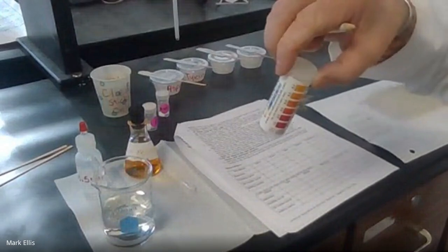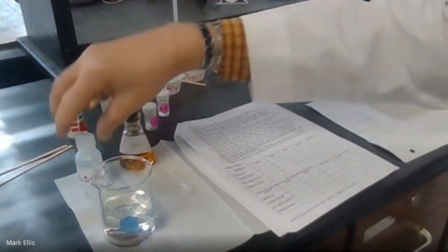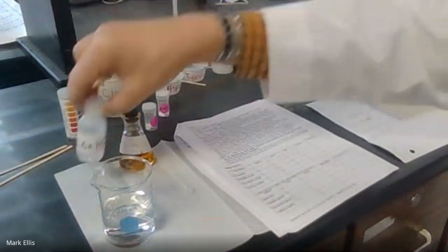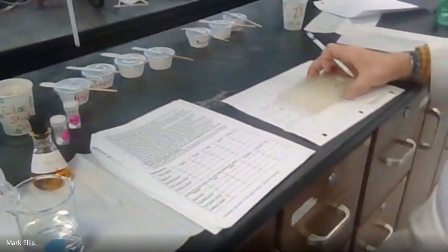Same with this. If you take the cap off, put the cap back on. Same with this. If you take the cap off, put the cap back on. Nice and neat all the way across.